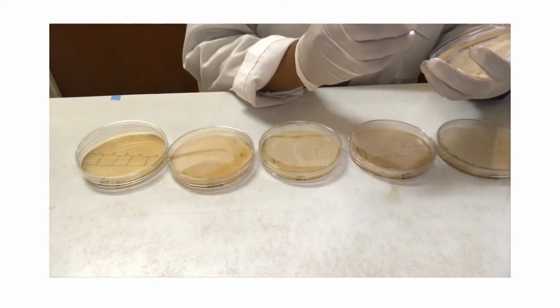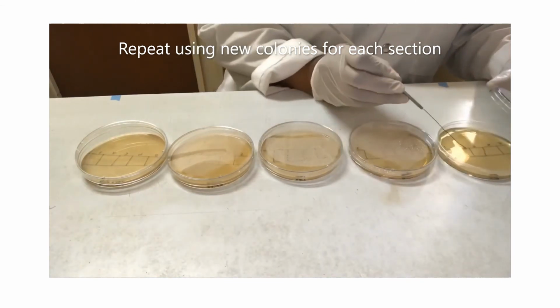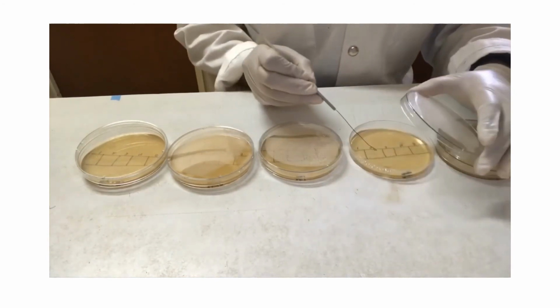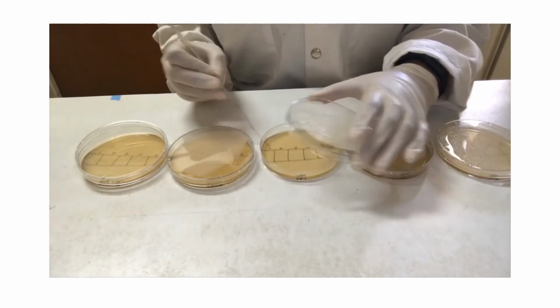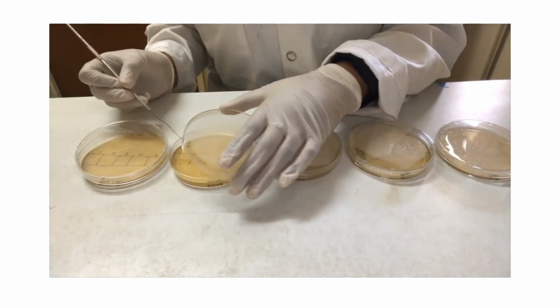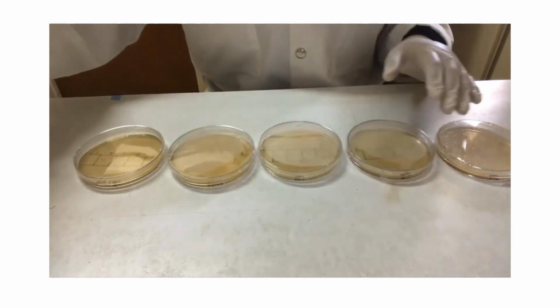The process is then repeated. Another colony of bacteria is collected using the sterile loop from the mating plate and transferred to section 2 on each of the antibiotic plates. The process is repeated each time with a new colony until all 5 sections on each antibiotic plate have been inoculated with recombinant bacterial cells.